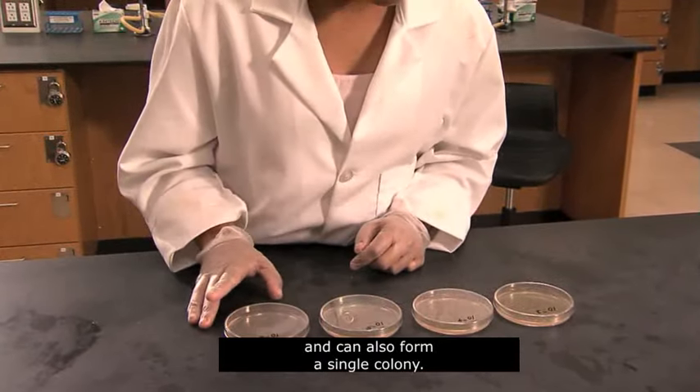To calculate the number of bacteria per gram or per milliliter of the original sample, use this formula: the number of colonies on the countable plate is multiplied by the reciprocal of the dilution of the plate counted. In our example, there were 89 colonies on the plate with a dilution of 10 to the negative 5. We multiply the 89 colonies by the reciprocal of that dilution, 10 to the fifth, to achieve a result of 89 times 10 to the fifth CFU per gram. Simplified to two significant figures, the concentration is expressed as 8.9 times 10 to the sixth CFU per gram.